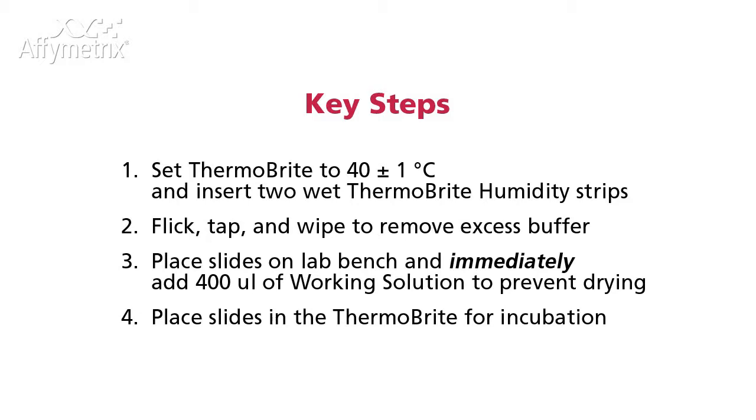Flick, tap, and wipe to remove excess buffer from the slides. Place the slides on the lab bench and add 400 microliters of working solution. Place the slides into the Thermobrite for incubation.